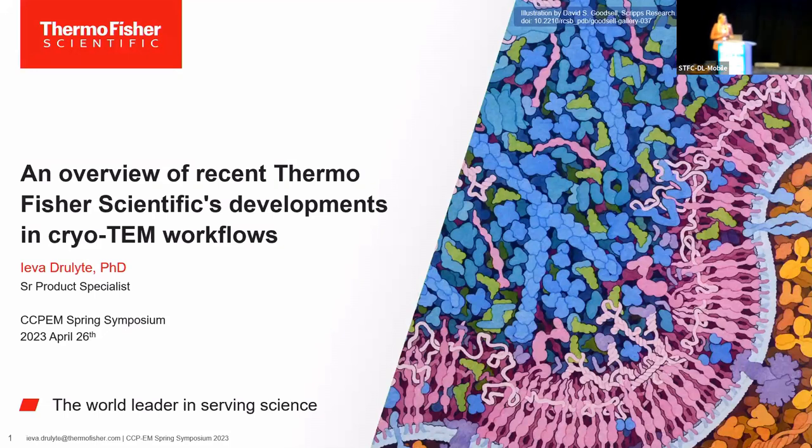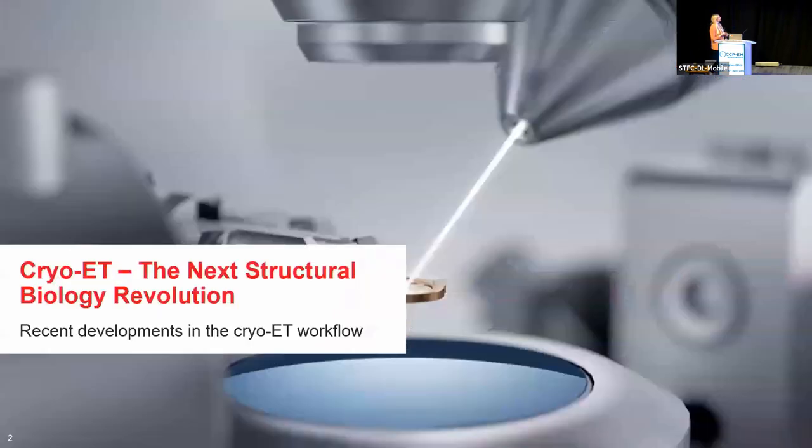And today I will tell you some things about our recent developments in different workflows, and I really hope that there is something for everyone. So let's get started. We will start with cryo-electron tomography and some developments both in sample preparation and on the software side.